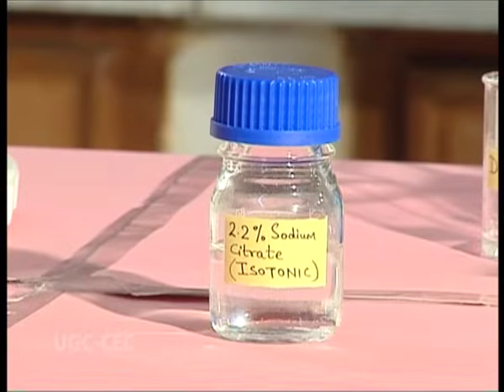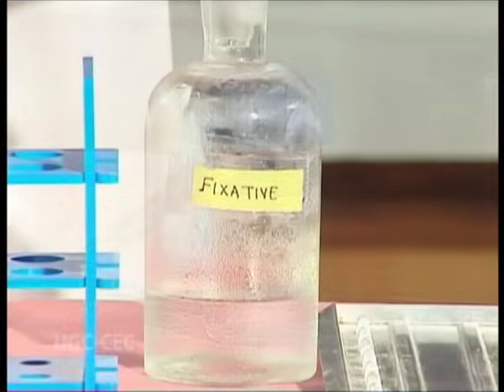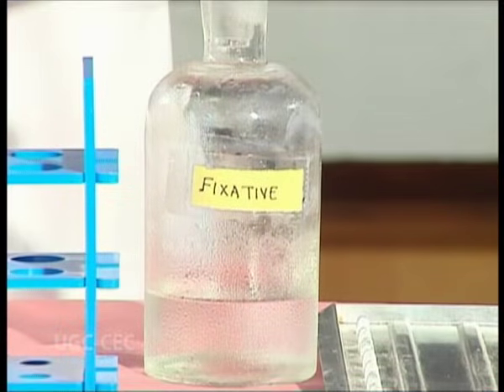To prepare the isotonic solution, 2.2 grams sodium citrate powder is dissolved in 100 ml distilled water. To prepare the hypotonic solution, 1.1 grams sodium citrate powder is dissolved in 100 ml distilled water. Fixative is prepared fresh by mixing 1 part acetic acid to 3 parts of methanol.